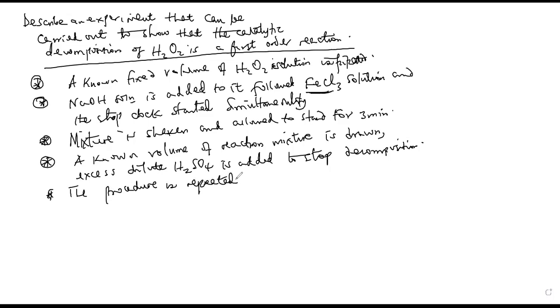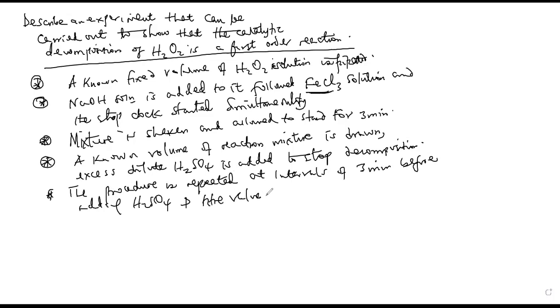The procedure is repeated, maybe at intervals of 3 minutes, before you add sulfuric acid and a titre value, V1, is noted.